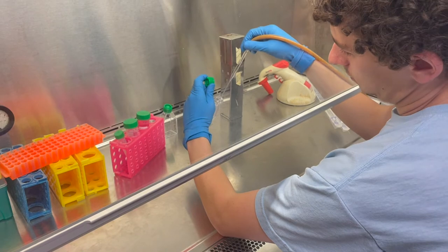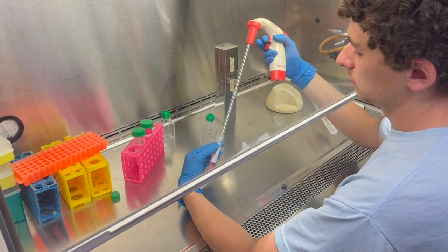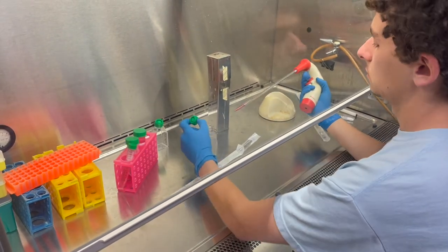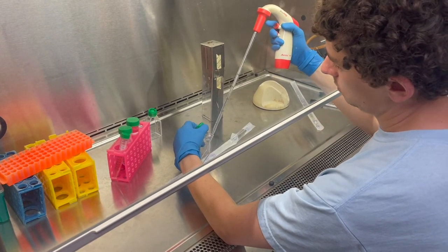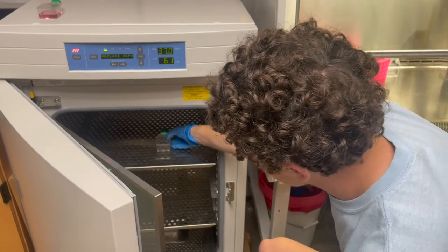Use a vacuum pipette to vacuum off the PBS. Using a plastic pipette, add warm trypsin to the back of the flask. Use 3 milliliters for a T75 flask and 1.5 milliliters for a T25 flask. Place the flask with the trypsin in the incubator on its back so that the trypsin covers the cells for 5 minutes.